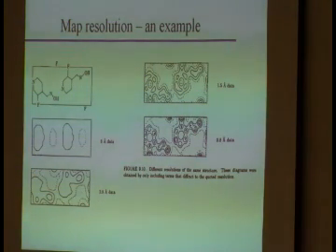How about we get some better resolution data? Here's 1.5 angstrom data. That's starting to look not too bad, right? I think most of us would be willing to assign something there. And there are some proteins that do scatter that well, okay? That's when you can really start looking at side chain orientations, things like that. So that would still certainly already be pretty useful. However, it's kind of tough. If you didn't know where the nitrogen is in this ring, would you be comfortable assigning it? No, right? How about this data set at 0.8 angstroms?